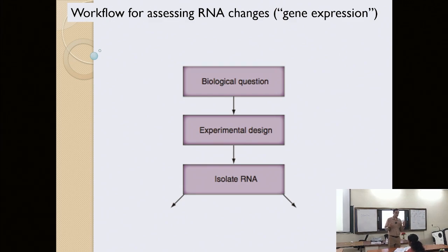So you are thinking about how many samples you want to get. So maybe 6 samples actually. So that's experimental design. And typically, if it is very expensive, then 3, but can be more. As many as possible, maybe 6 samples or even 10 samples if it's cheaper, because that gives more statistical power. Okay, and once the experiment is designed, then isolate RNA.